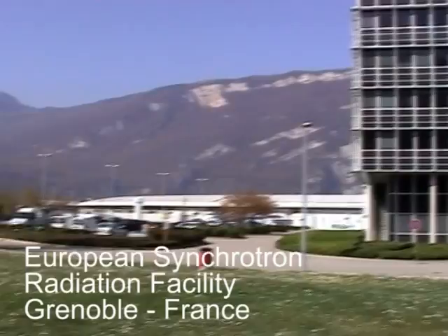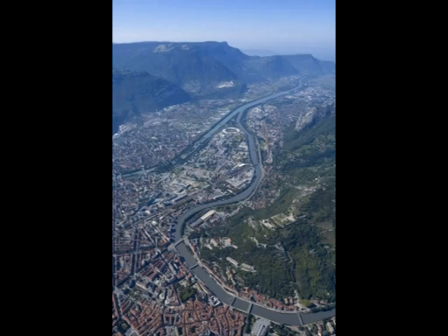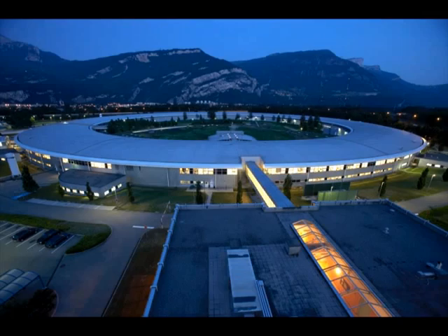For a more precise analysis, a more intense beam of X-rays is used. This beam is produced by a particle accelerator called a synchrotron. The European synchrotron in Grenoble is one of the biggest and most powerful instruments in the world.